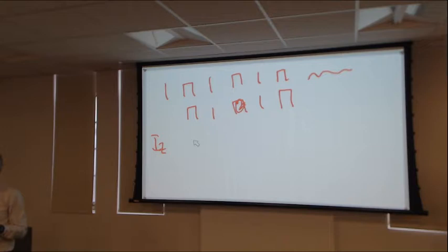So what can go wrong here? Well, first of all, I may want to know more about relaxation effects than assuming some block like T1 or T2. So I may want to know much more about the details of relaxation processes. But the other thing that can happen is I might need to turn on an RF pulse for times that aren't really short compared to either relaxation or to the scalar couplings.